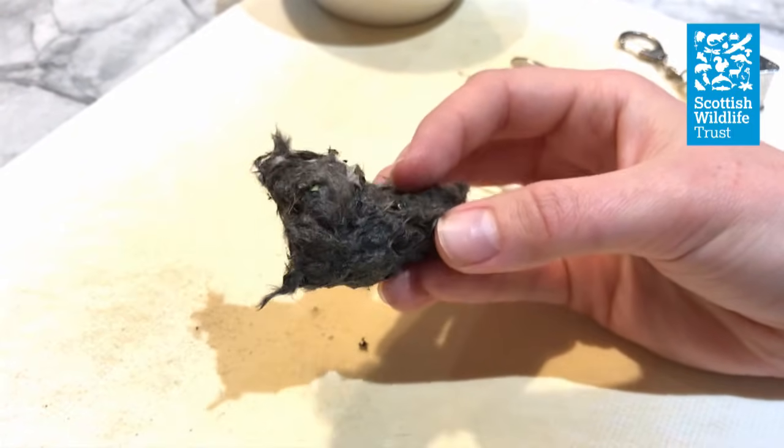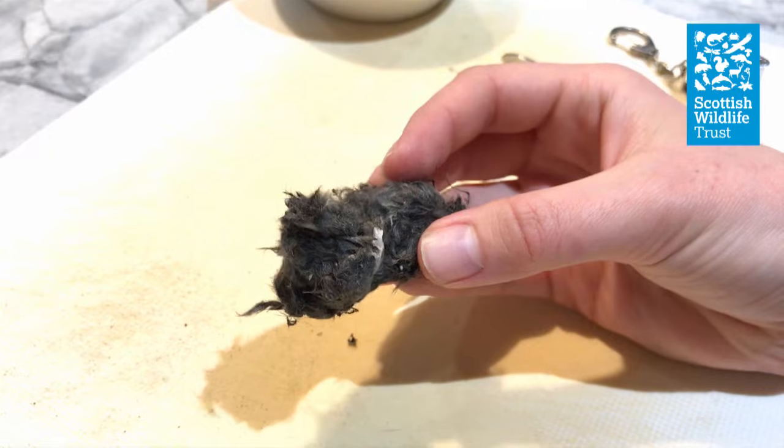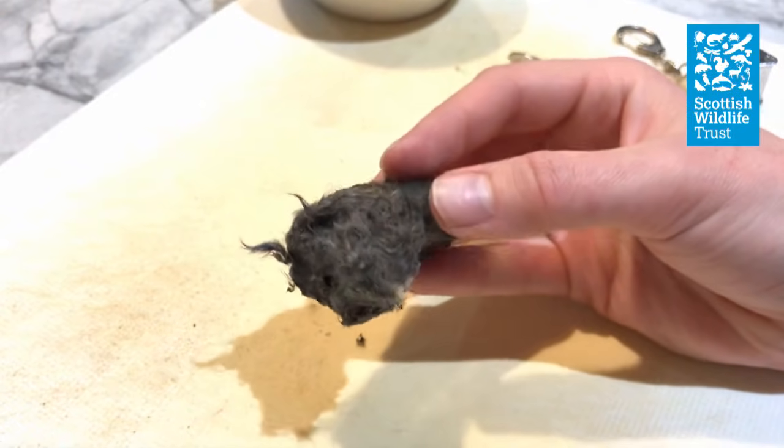All species of owl produce pellets, but the ones you're most likely to find and the one I'll be dissecting in this video are barn owl pellets.